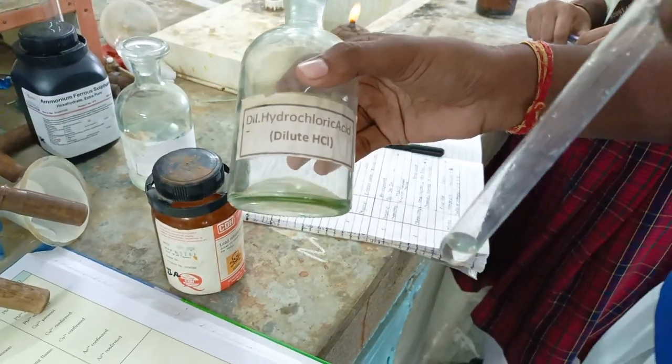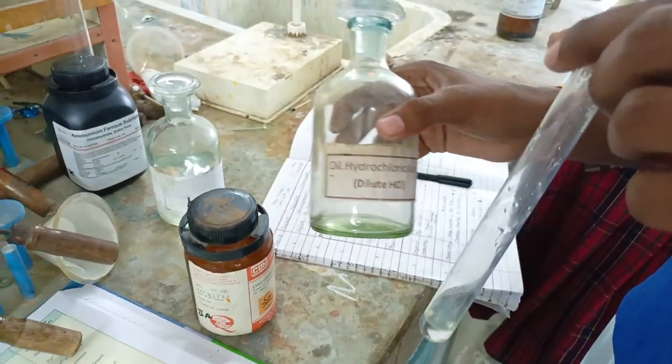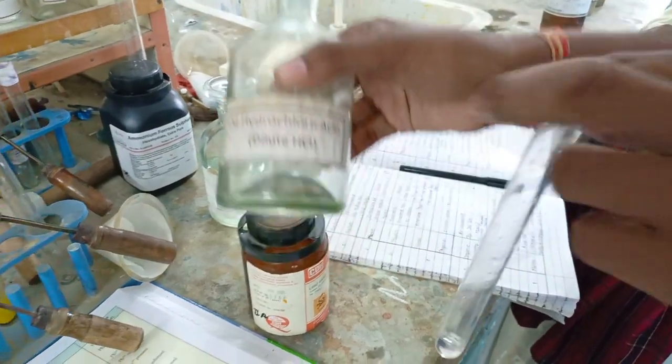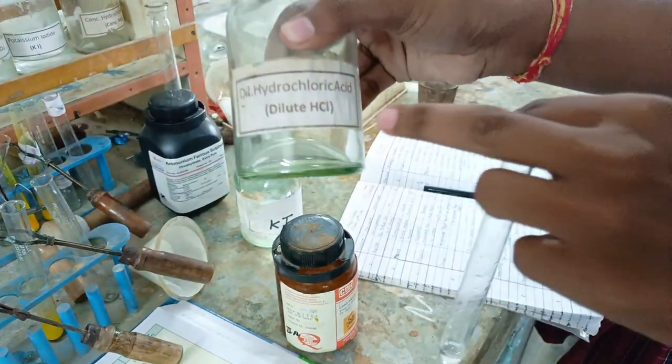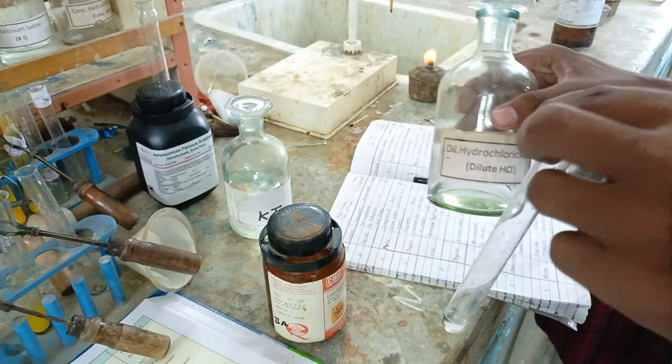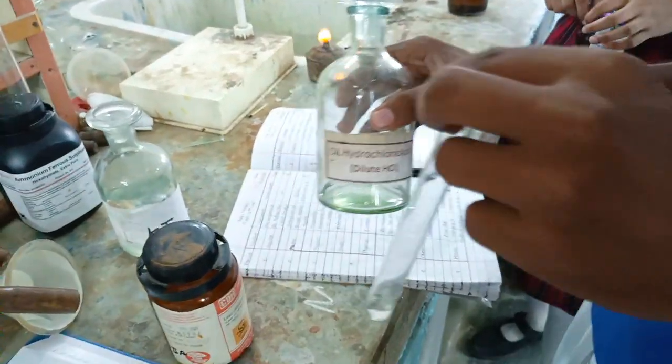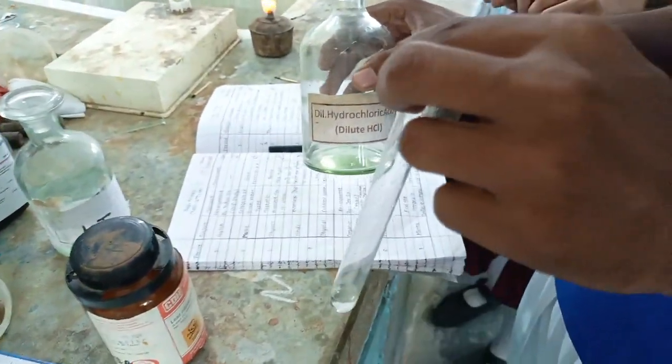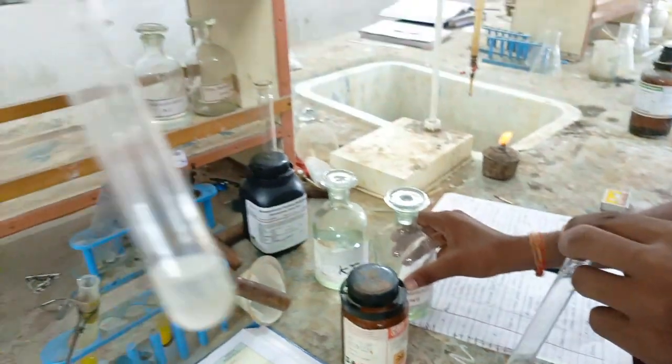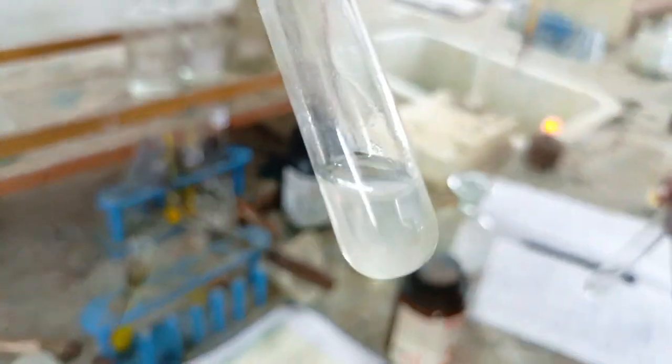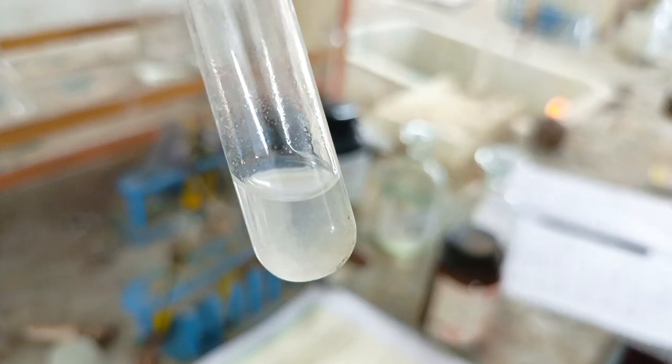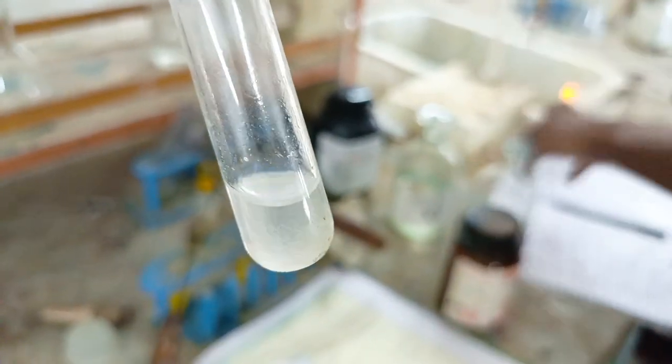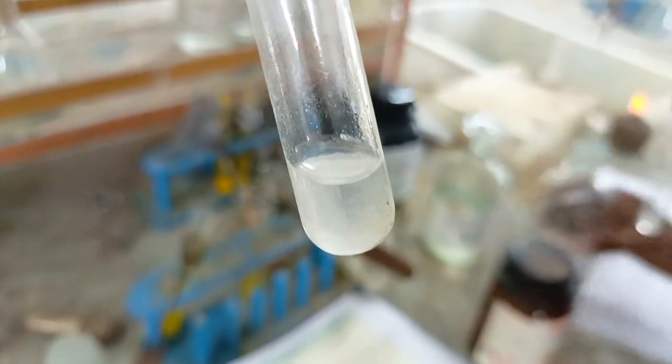Then wash the precipitate with water and add 10 ml of water and heat. After heating, it will form liquid again and the precipitate will dissolve. We will separate the dissolved precipitate into three different test tubes.